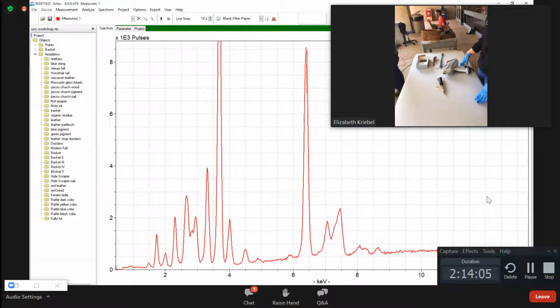Just a question: since that section has so much salt, how come there's no transfer to other areas of the object? Wouldn't that just naturally occur? So, the mercury is moving in a very small quantity. The salt is just going to be salt crystals coming off of it. They're physical, right? They're not going to stick to the object. That's what makes the mercury so pernicious, because it goes everywhere. It isn't just that they're dangerous; it's that you cannot control them. Once they're there, you could say a horse is loose in the hospital. They're everywhere.